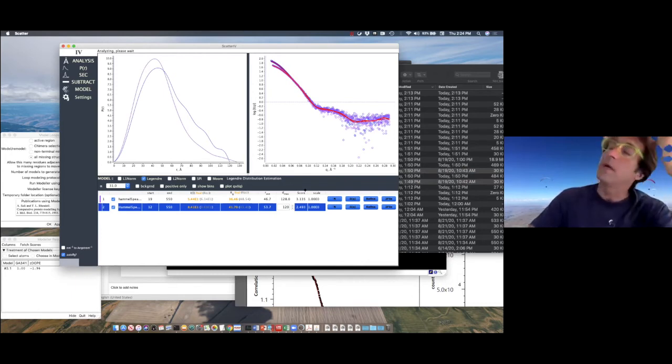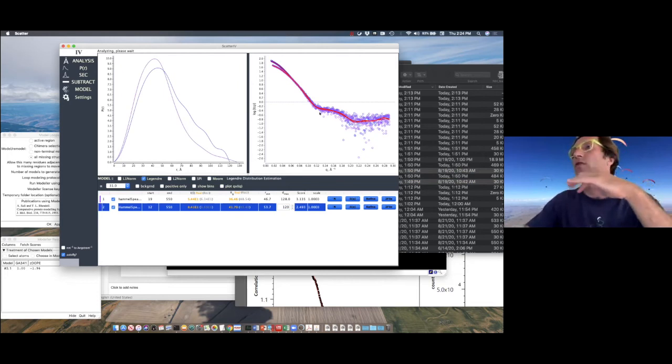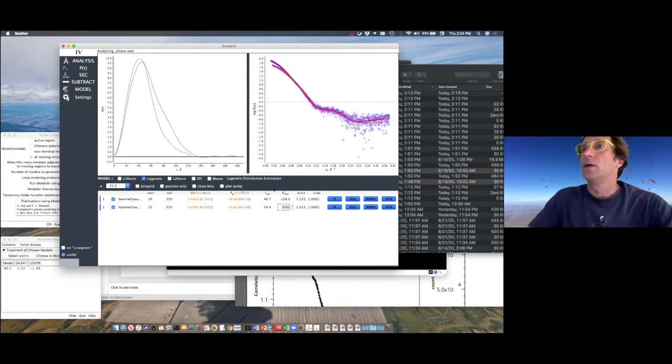What Rob mentioned, regularization, basically distinguishes noise in a curve from signal, using the so-called indirect Fourier transformation to not overfit the noise with these bumps you see here. In case you see these bumps, you have a problem with overfitting, or in this case, underestimating Dmax. So again, we can extend it a little bit. Okay, so indeed it's not 200, but about 140.